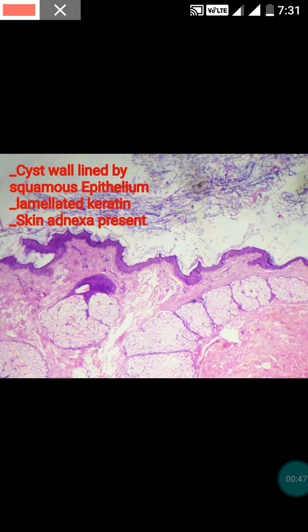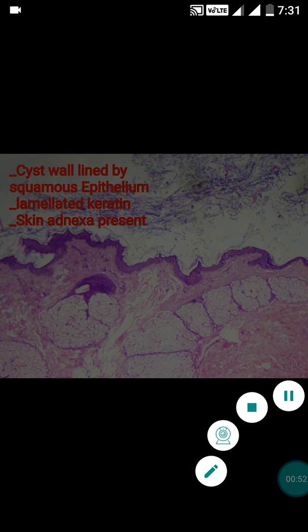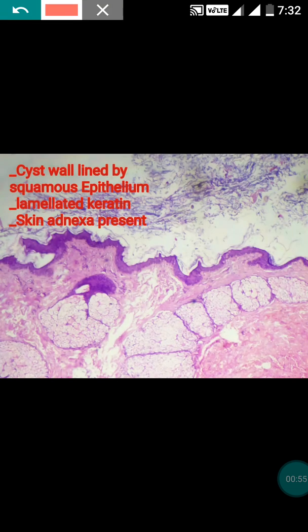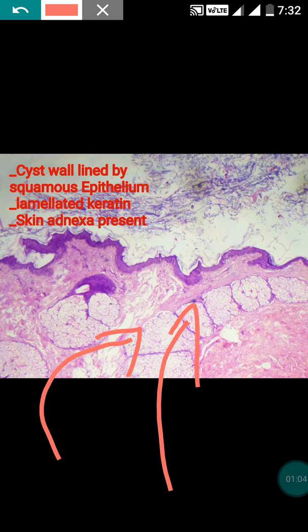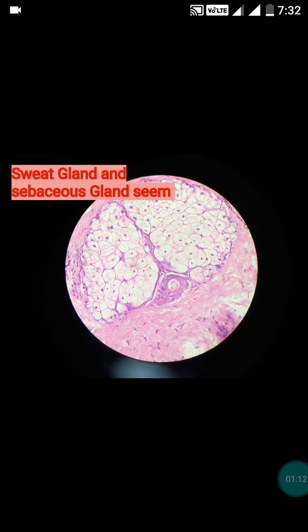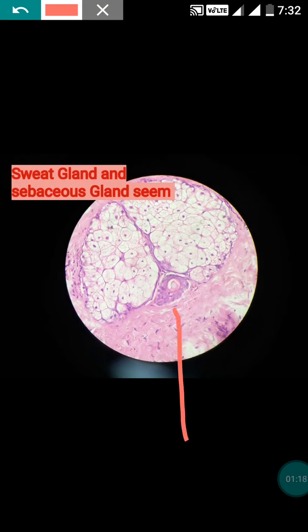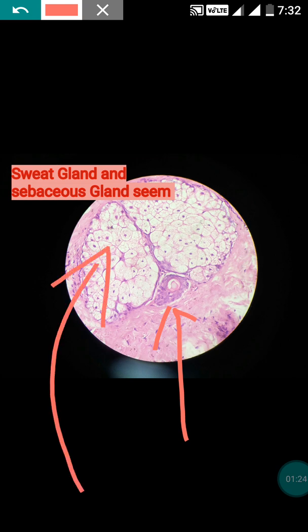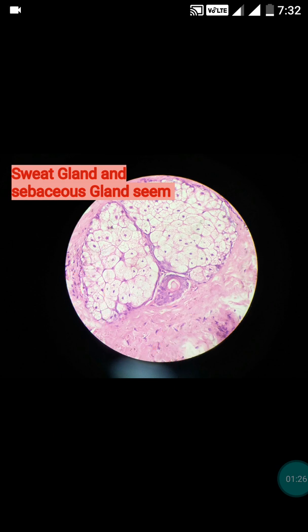The third important point used for diagnosis of dermoid cyst is the presence of skin adnexal structures — sweat glands and sebaceous glands. The sebaceous glands have clear cytoplasm. This is the high power view of the skin adnexa present beneath the epithelium. You can see both the sweat glands and the sebaceous glands.